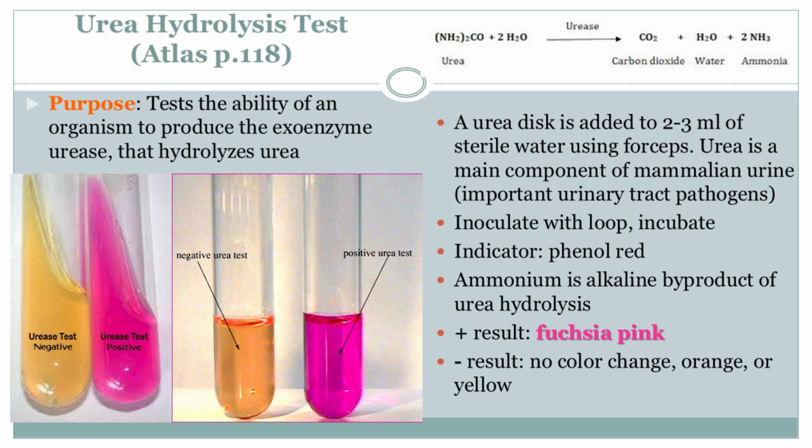We do use something called a urea broth, or sometimes a urea slant. Urea broth, urea slant. Those sound kind of fancy. They're just specialized test tubes, really, designed specifically for this type of testing. Okay, so we've got our test tubes, they've got this broth in them, and the pH indicator too, right? That's right. And then we carefully introduce a sample of the bacteria we want to test into the broth.